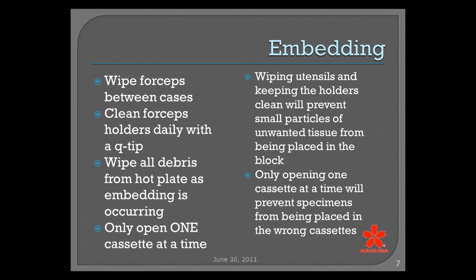And when I'm done with the case, I'll just wipe my forceps on my towel and then stick it back into the forceps well holder. Those well holders for your forceps, however, after time, they are going to get all kinds of little tiny particles, little tiny tissue samples inside of them.